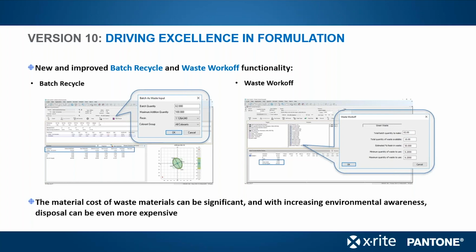But again, the importance of this feature is that it saves time, and it also has an environmental factor, because the cost and the problems associated with disposing of waste material are increasing, and this tool is an effort to help with that. So again, being able to utilize as much of your waste material as possible saves you time and money, but it also has an impact on our environment.